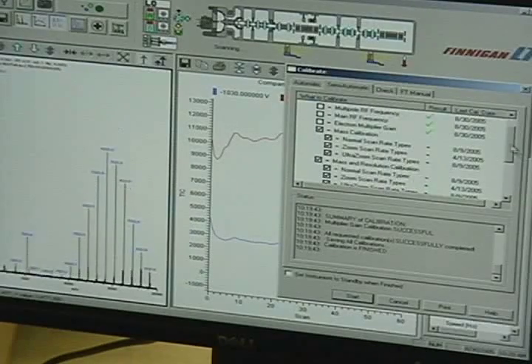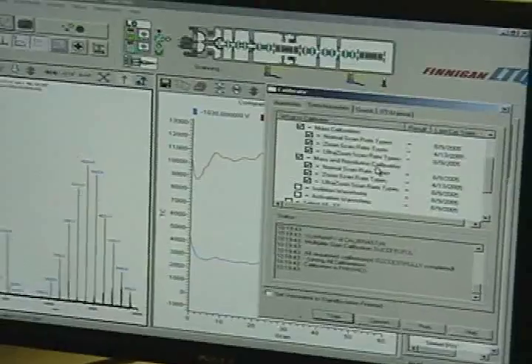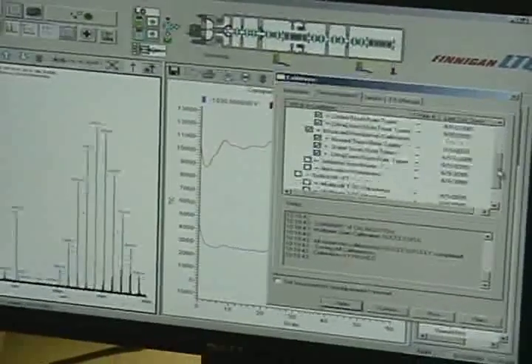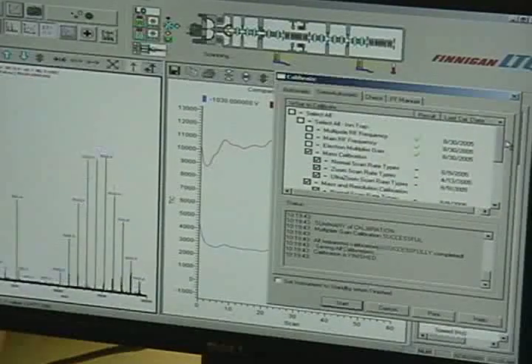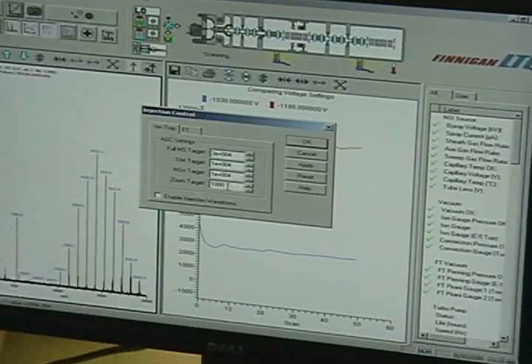Resolution calibration. To me, it never makes sense to run mass without resolution, so I run them all at once. We always fill sample. We never use them, but we always fill. What is your zoom target? Oh, only 1,000. Let's put it up at 3,000.